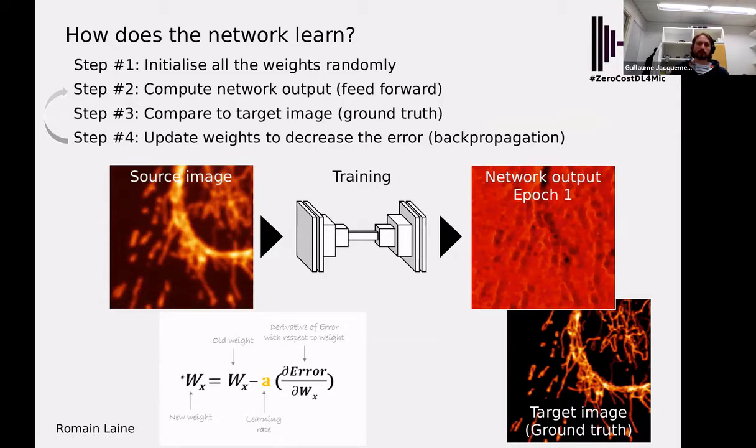And how does it do that? Well, first, when you start the training, all those weights and parameters I was describing before are initialized randomly. So the first time your image goes through the whole pipeline, you get an image which is completely ridiculous and doesn't actually mean anything. But what the network does is that it compares that image to what you want to achieve, and scores how well they match. And if they don't match well at all, then you get, of course, a poor score.